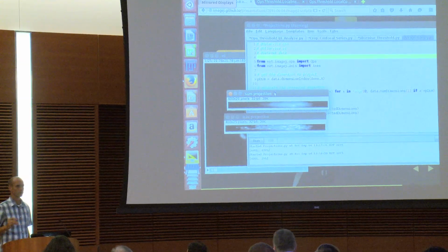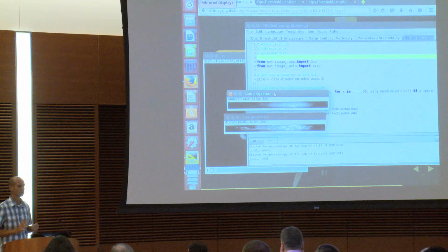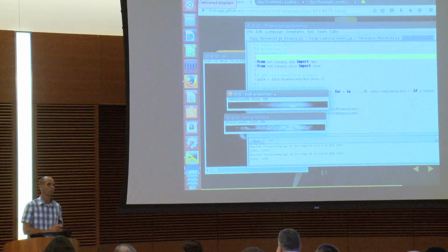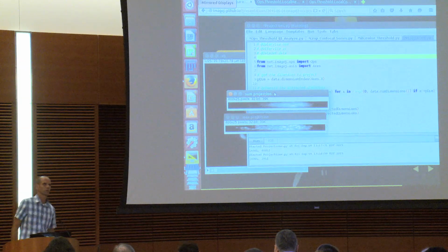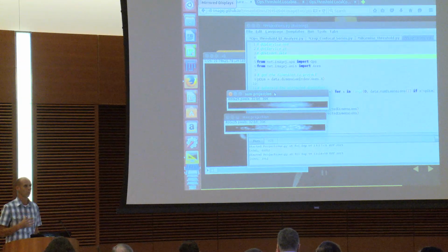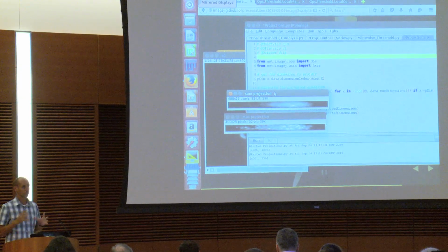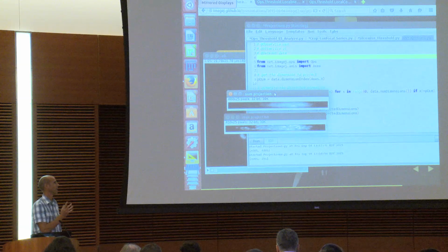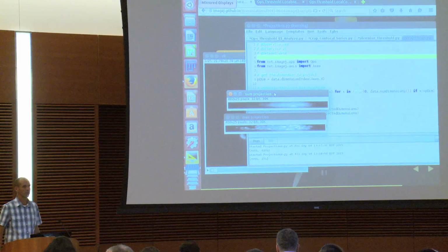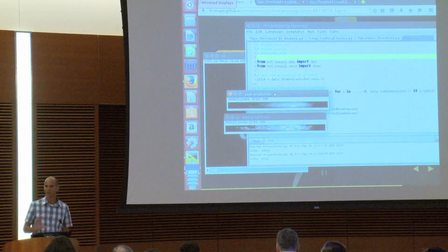A lot of the development of this project is sort of an exercise in starting from something really, really powerful, but kind of complicated, and then adding simpler ways to access it. So a lot of the work that's being done is with these namespaces, adding simpler versions of the op, more signatures in the namespaces, so that you have easier ways to access this functionality. So this one, no question, is going to be much simpler next year, or probably maybe even next week. However, there will always be sort of advanced functionality that you might want to take advantage of.